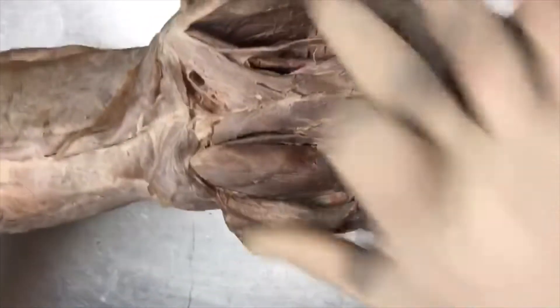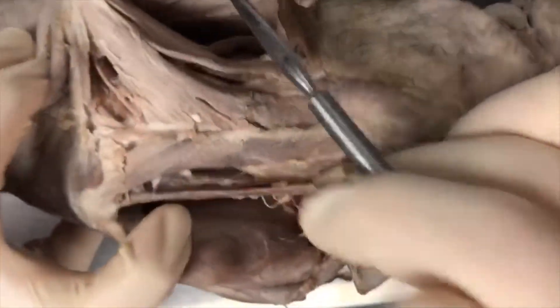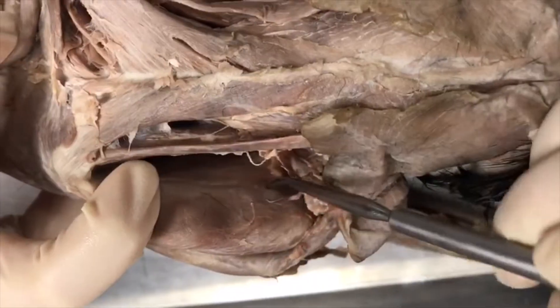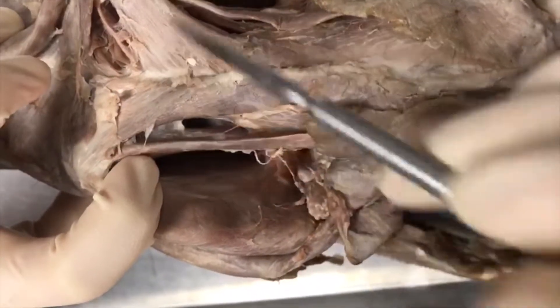If we take the cat and flip it back up like this, the inside aspect here is going to be your subscapularis — inside of the scapula, subscapularis.